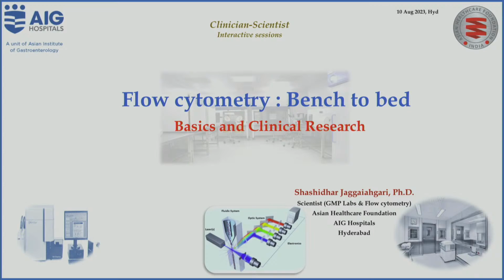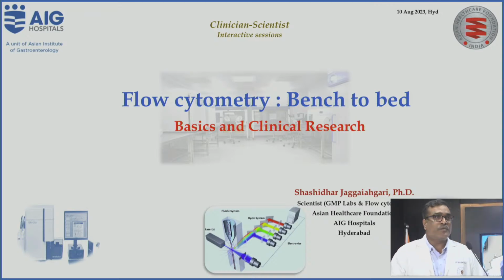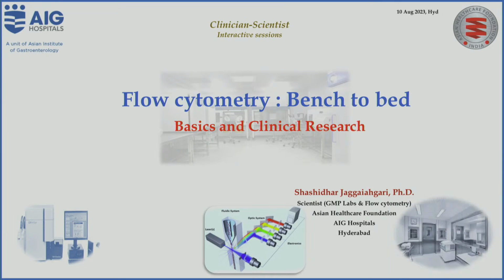Thank you, Dr. Ru. Welcome to the Clinician Scientist Interactive Session. Today I'm going to talk about the basics and clinical research applications of flow cytometry, which we use regularly in our research activities.